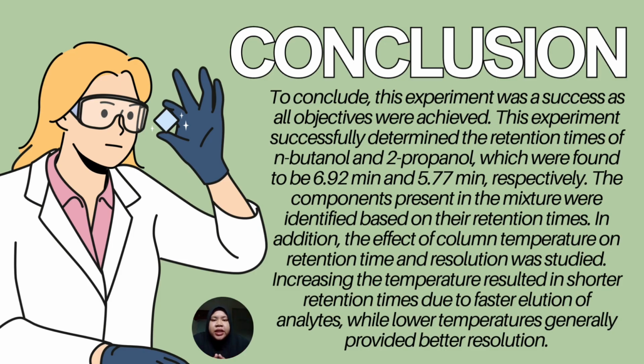The components present in the mixture were identified based on their retention time. In addition, the effect of column temperature on retention times and resolution was studied. Increasing the temperature resulted in shorter retention times due to faster elution of analytes, while lower temperature generally provides better resolution.